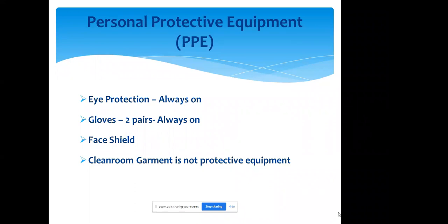And then whenever it's soiled, you do the same thing. If you are working with chemicals at the fume hood or wet bench, you always have a safety shield on, because most of the chemicals you are going to be working with in the clean room are not like your 1 molar solutions. These are concentrated solutions. So you always have a face shield on.